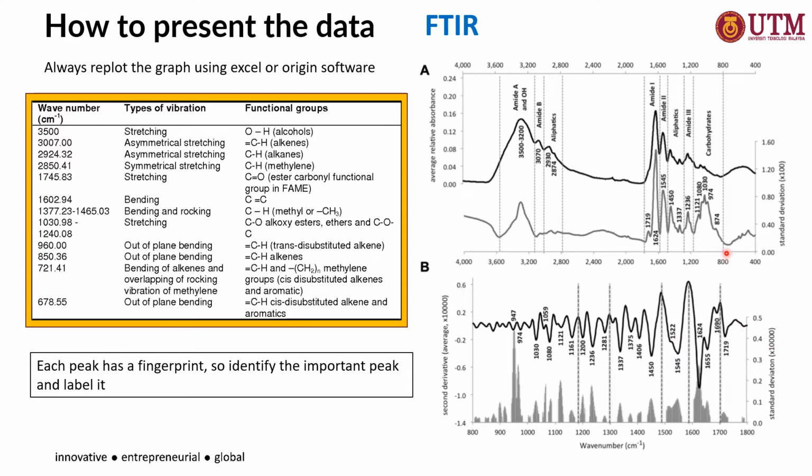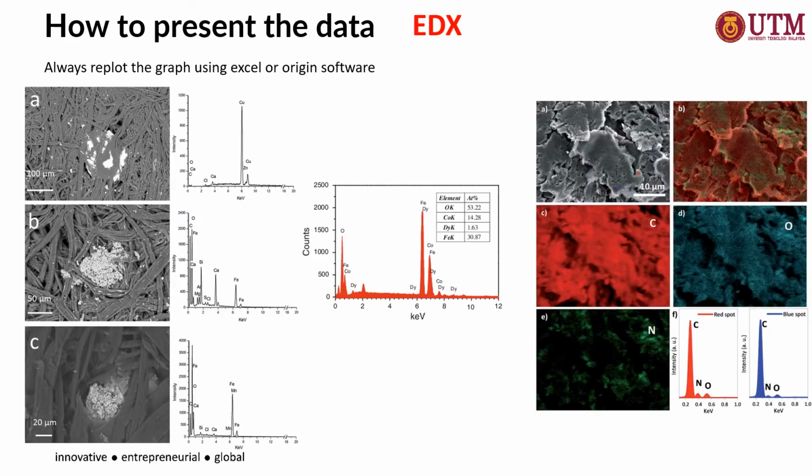discuss during the presentation. Next, for the EDX, similar to other graphs, you always need to replot the graph using Excel or Origin software. There are a few techniques to present the EDX results. For example, if you only take the EDX result without the SEM image, you can use this kind of technique to present your sample.